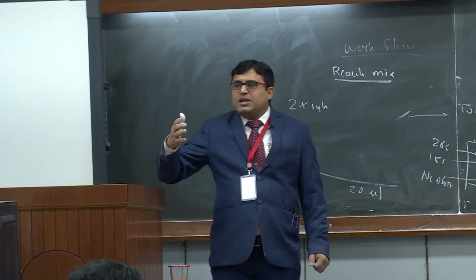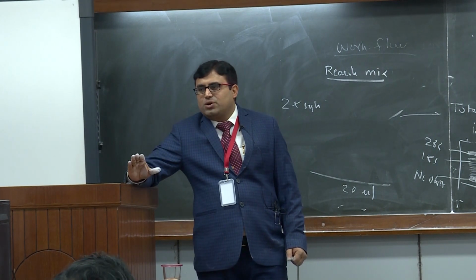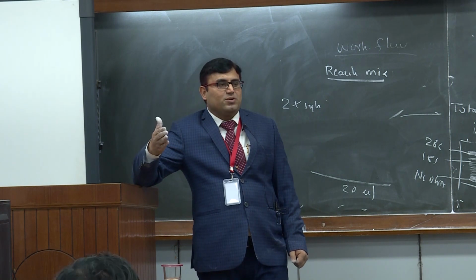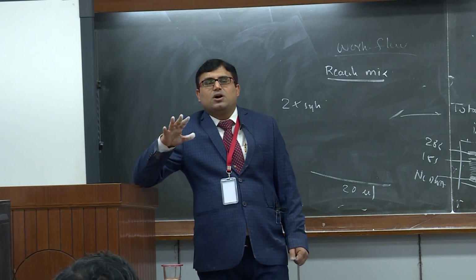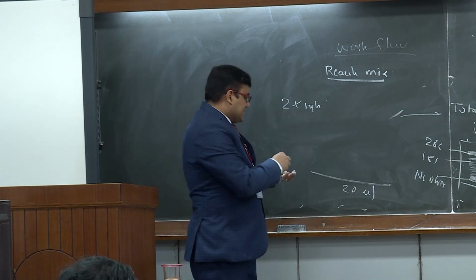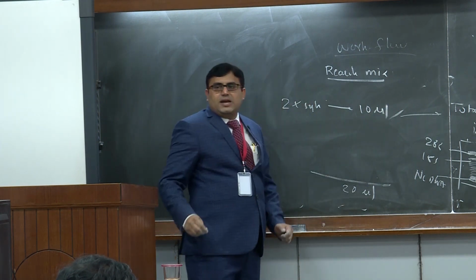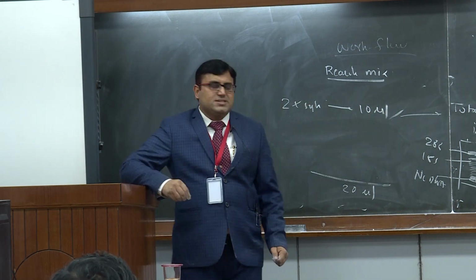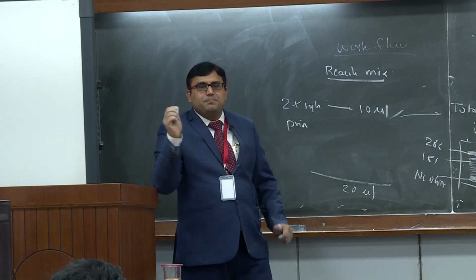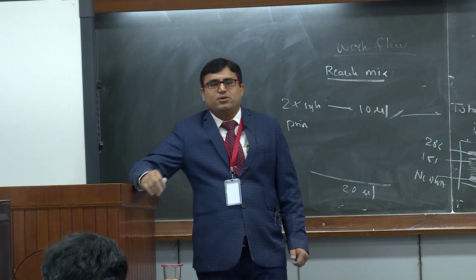If you are an expert and you have a large number of samples, you can decrease this volume to 10 microliter also. It will not have influence on the result, or you can increase up to 50 microliter also. But the most optimum volume is 20 microliter, and since this is in 2x SYBR form, here you have to take 10 microliter, right? Next is your primer. And when I write 2x SYBR mix, it means enzyme and other things are already mixed with your SYBR.